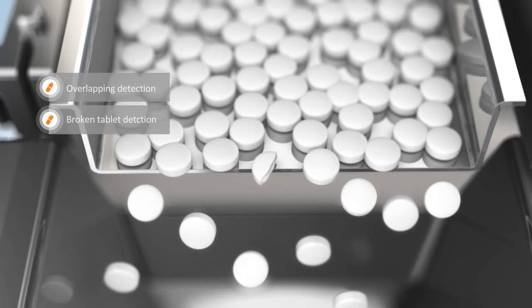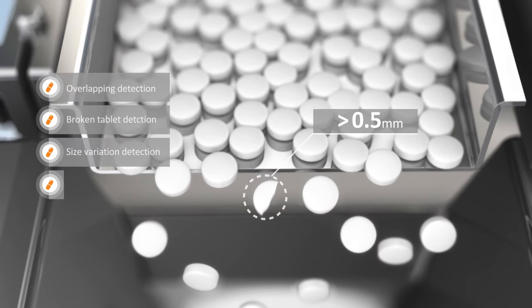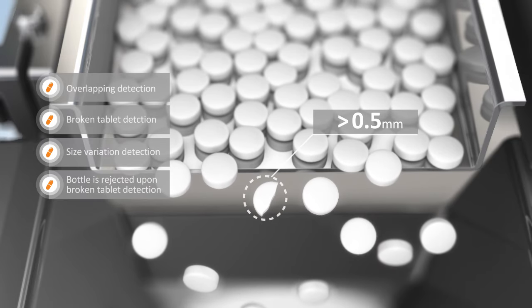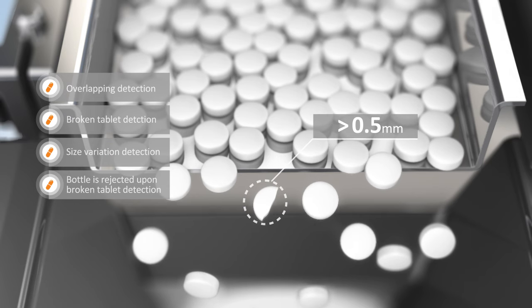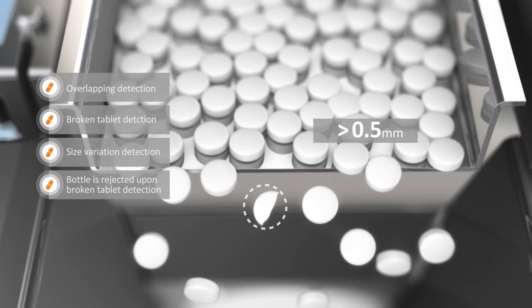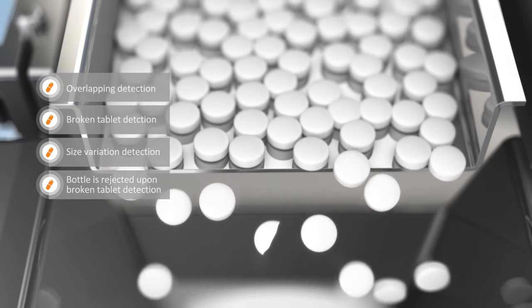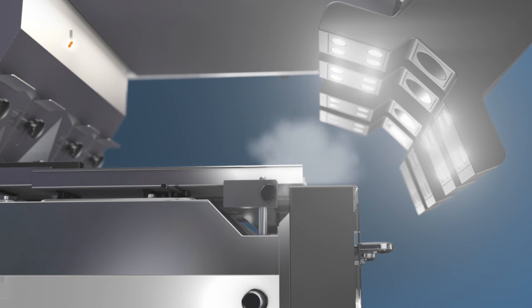Broken tablets as small as 0.5 mm are detected. Once a broken tablet is detected, the container is immediately rejected, saving both time and money.